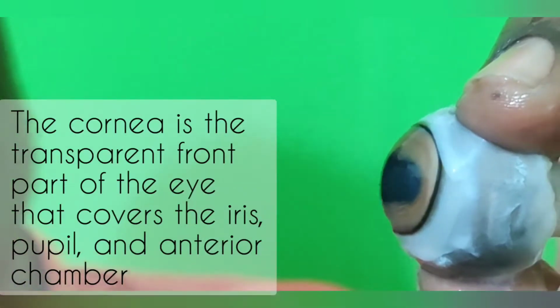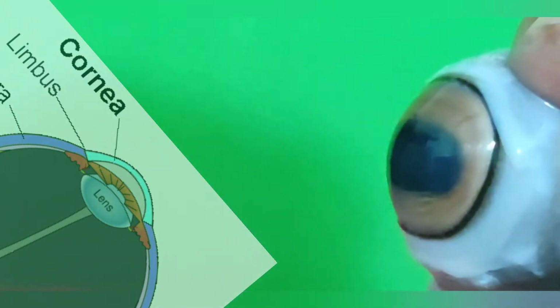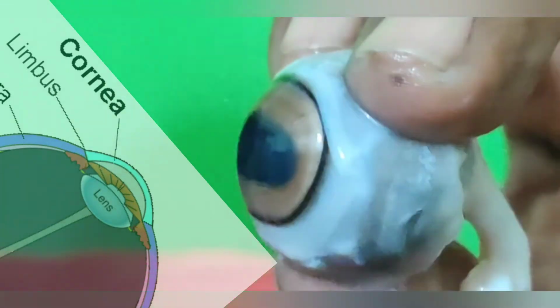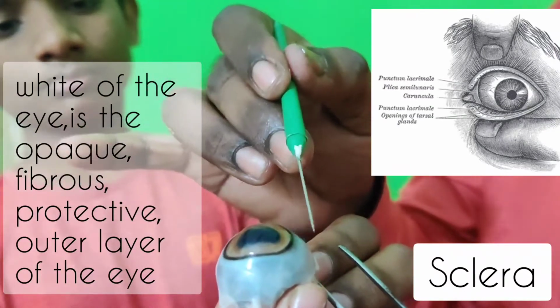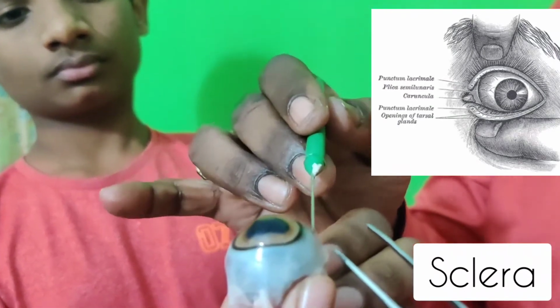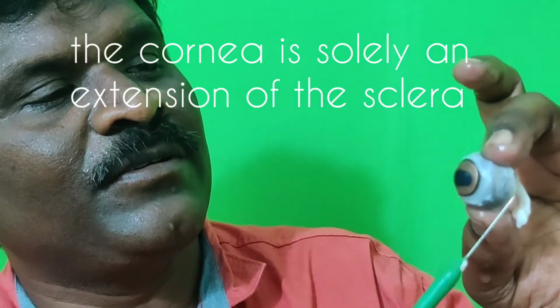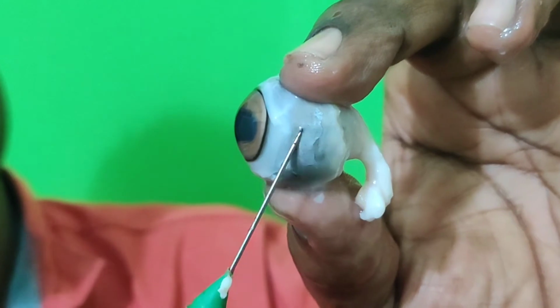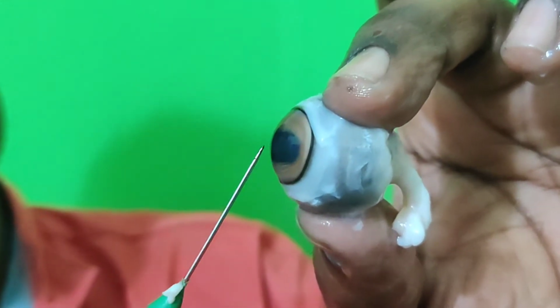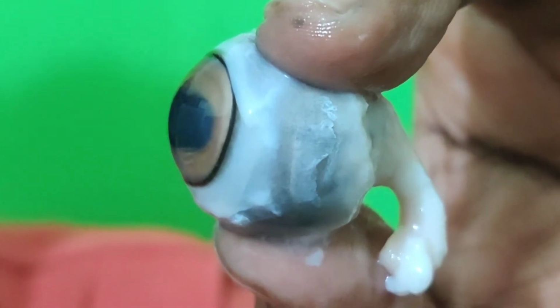This is cornea, the transparent front part of the eye that covers the iris, pupil and the anterior chamber. Sclera or white of the eye is the opaque, fibrous, protective outer layer of the eye. Actually, the cornea is an extension of sclera. Generally, in human eye, sclera is in pure white color. Here, it is a goat eye. The sclera of the goat eye is not completely white.